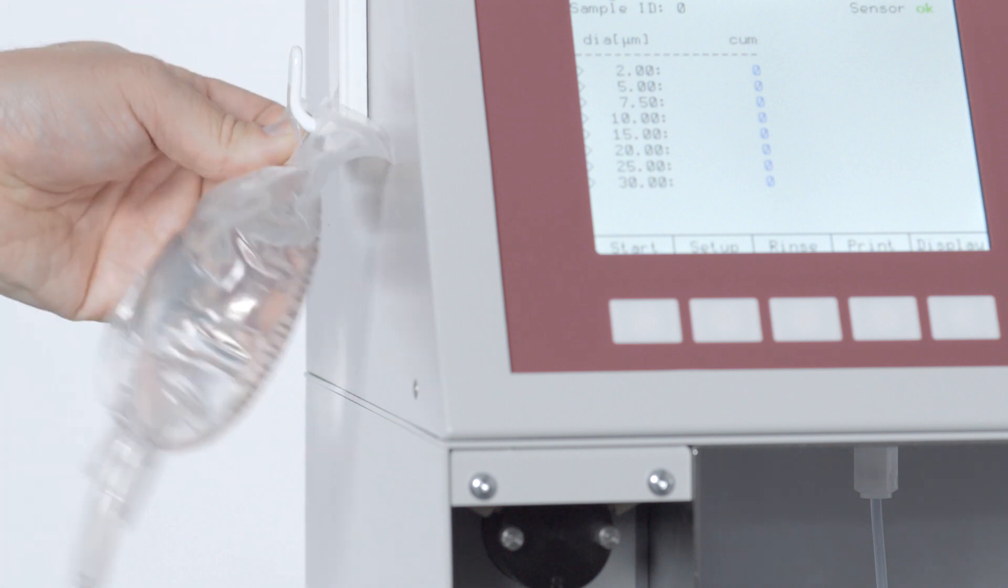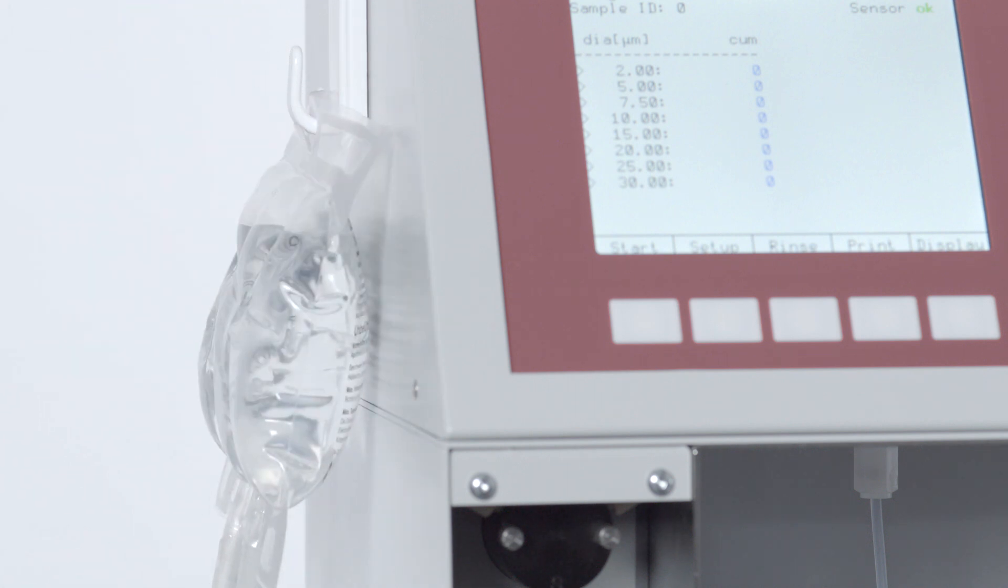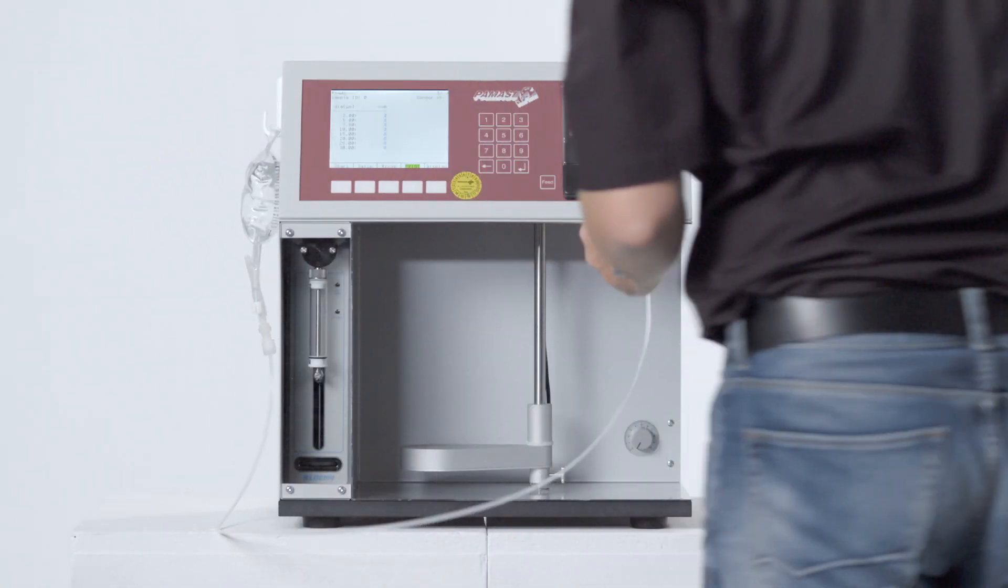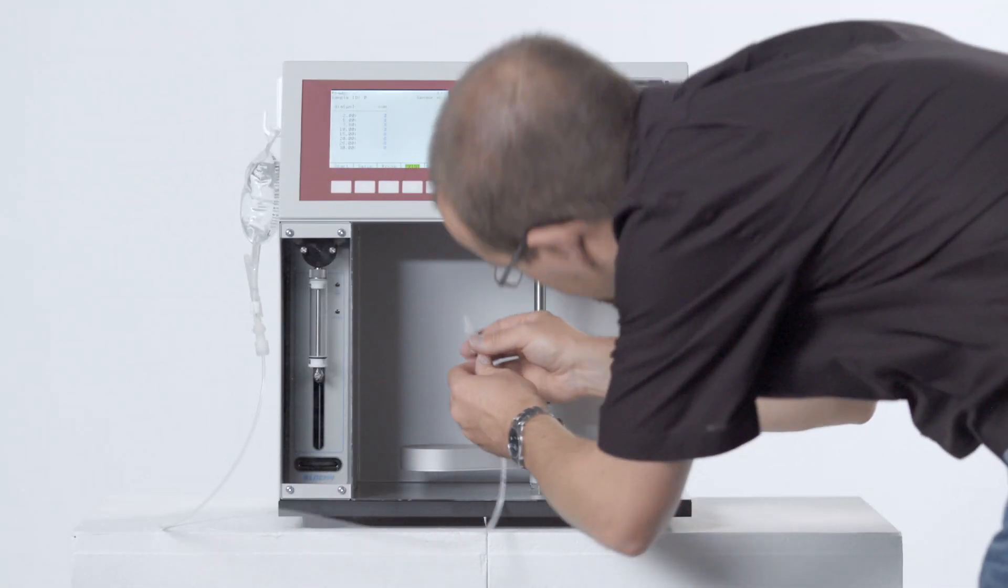One of the key benefits is the instrument's versatility. Infusion solutions can be directly analyzed out of the infusion bag.